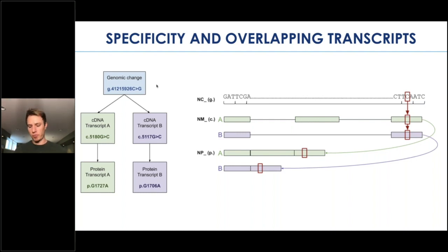So if you do a search for an intronic variant and 200 results are returned, there might be a really good specific result 100 results into the list, and you miss that because it takes too long to go through every result with the same rigor that you would if you only had 5 results to look through.